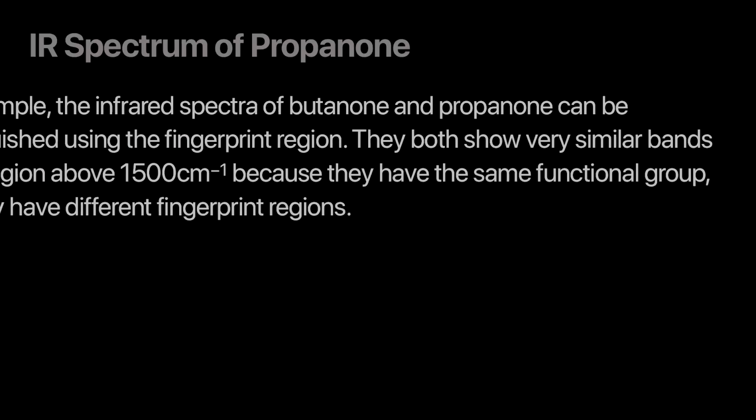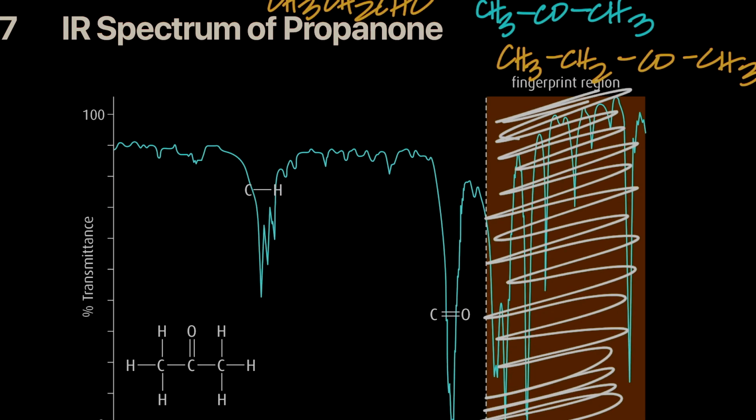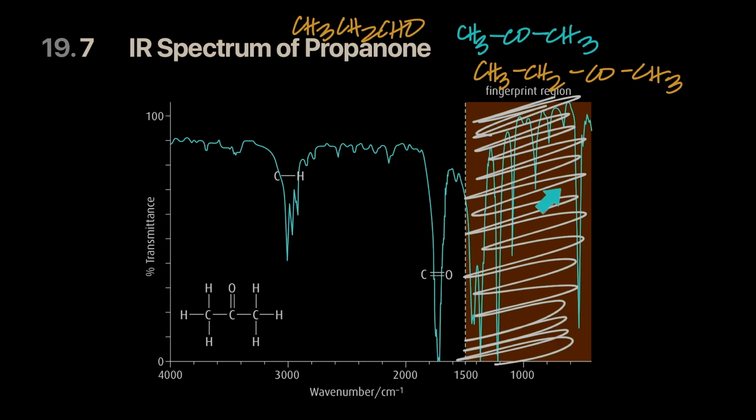Listen, guys. The reason why that is called a fingerprint is you're going to find a lot of troughs there. And you'll have to ignore most of them, because we can't tell the functional groups from that. In the non-fingerprint region, the only troughs that you will see are for specific bonds you're looking for. But in the fingerprint region, you will have one or two that will be maybe because of bonds like CO and CCl. And the rest will be fingerprint that we'll have to ignore.